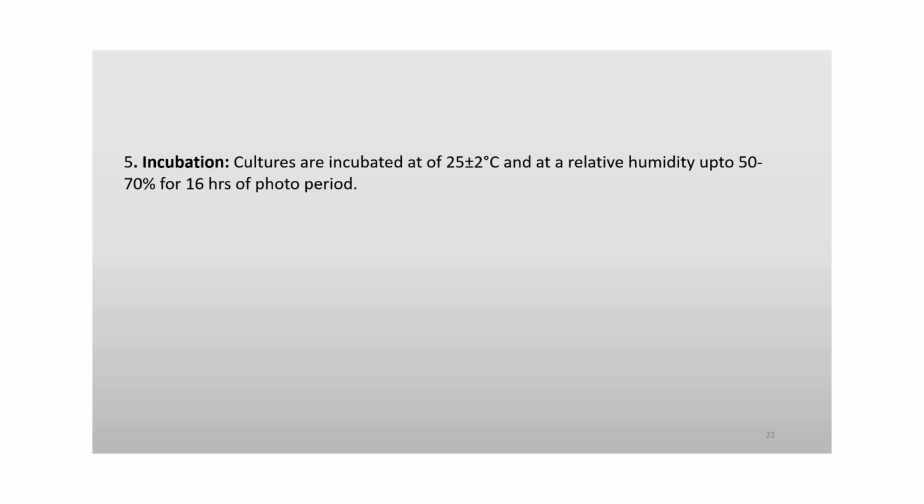Incubation, the next step: cultures are incubated at 25 plus or minus 2 degrees centigrade at a relative humidity of 50 to 70% for a 16 hour photoperiod.